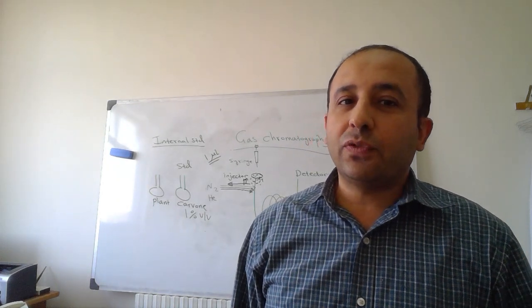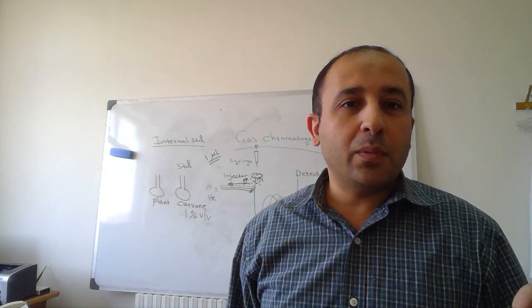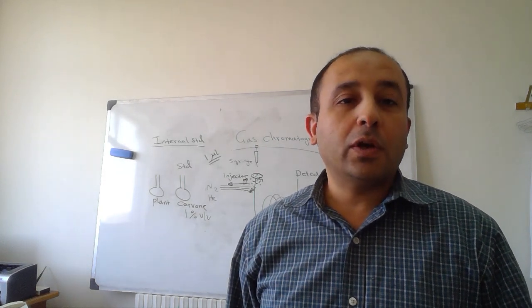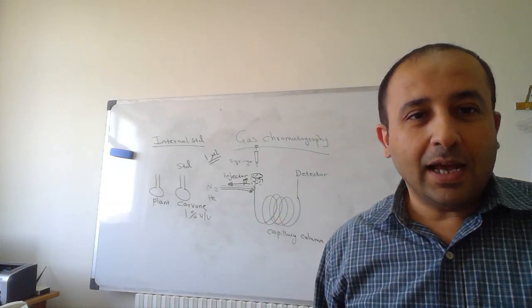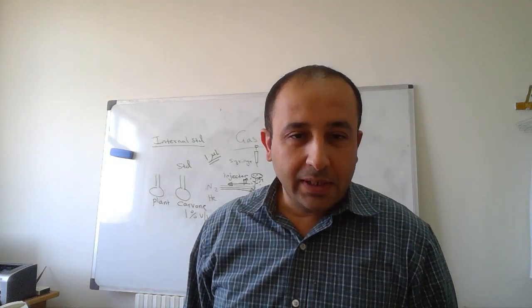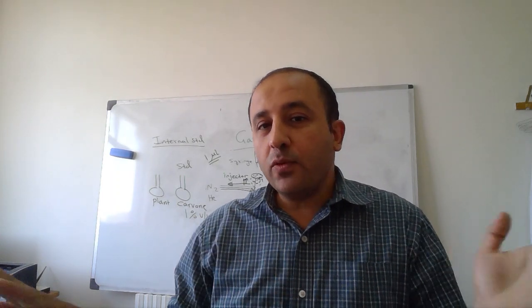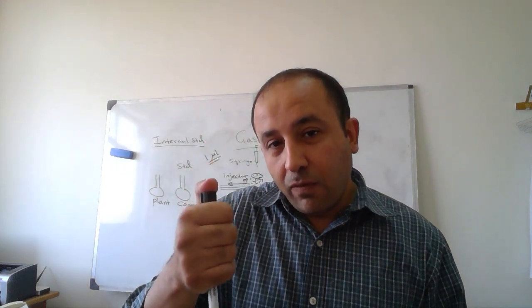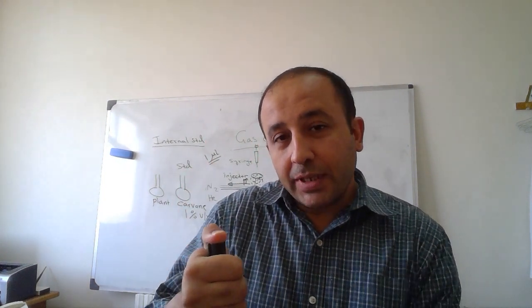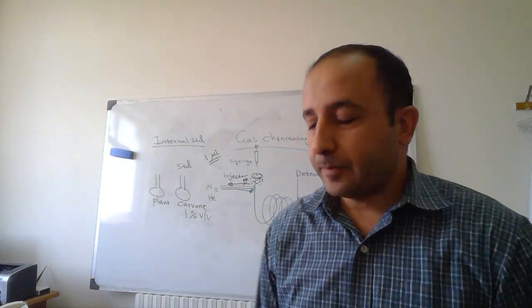So if I inject, for example, by error 2 microliter instead of 1 microliter, then I will have a doubled quantity of carvone in the plant extract. And this is scientifically not acceptable. So how can I remove the error of the volume during the injection from the final results?